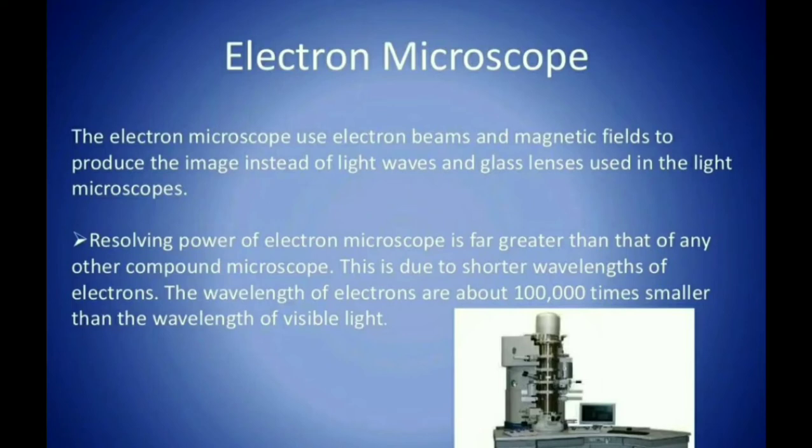An electron microscope is a special type of microscope with high image resolution, able to magnify objects in nanometers. These images are formed by the controlled use of electrons in a vacuum. It is a type of microscope that uses a beam of accelerated electrons.